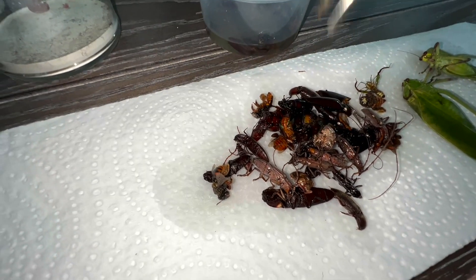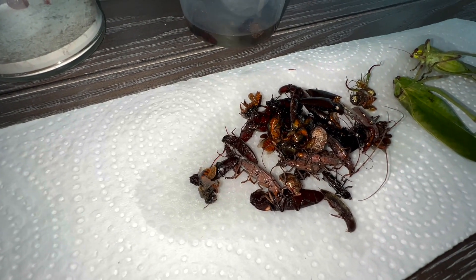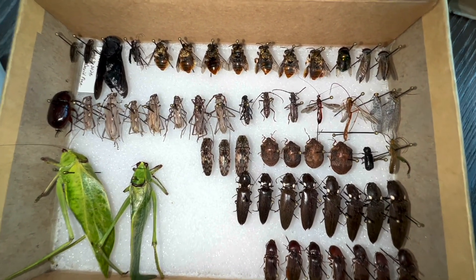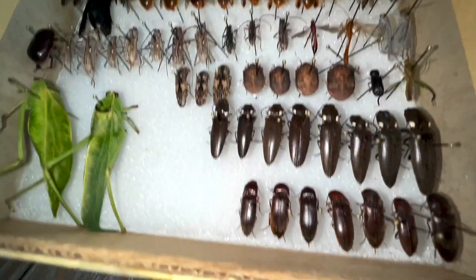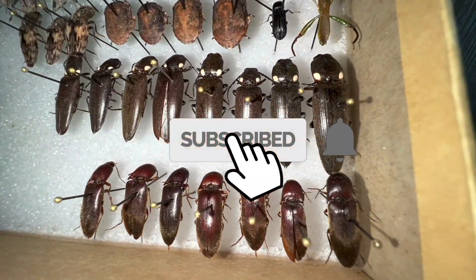We've got more bugs in here than I thought. All right, so here's last night's harvest of insects, minus moths. I've got a couple of katydids that came into the light traps.